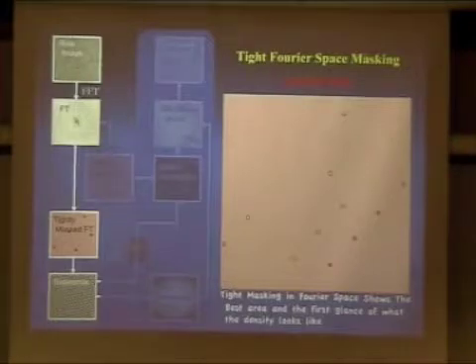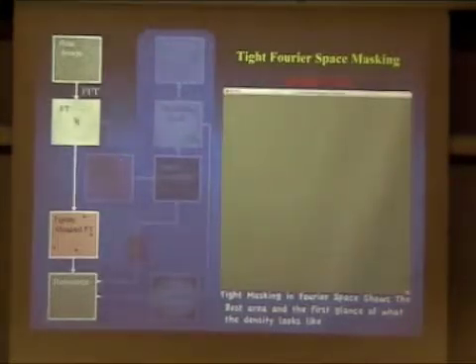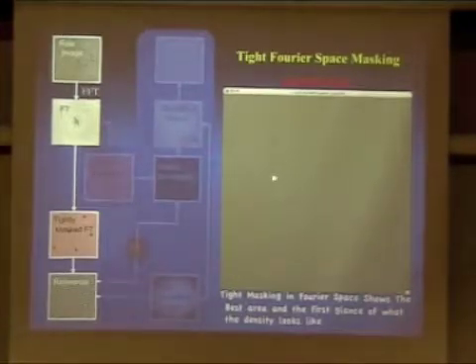To create the reference, we mask out everything except where the diffraction spots are expected to be. In other words, we are assuming that everything is perfect. When you do so, and then back Fourier transform, you get a map looking like this. You should be able to see that you almost can see what this map is going to look like at the end.